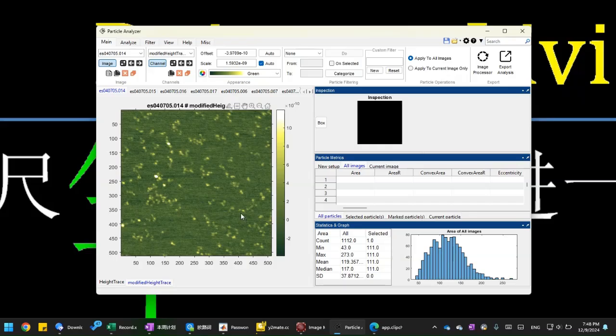So here I'm going to do some quick filtering of my particles based on some simple metrics, such as area and volume. And for our purpose, let's use volume to filter the size of our particles. As you can see, these are protein images, and this is very densely populated. Some proteins overlap on top of one another. So you can expect to have a broader distribution in volume.